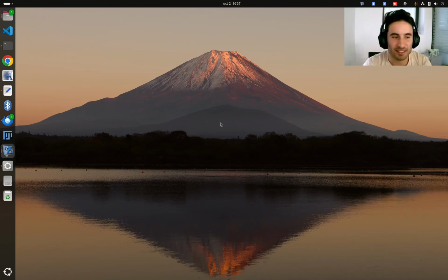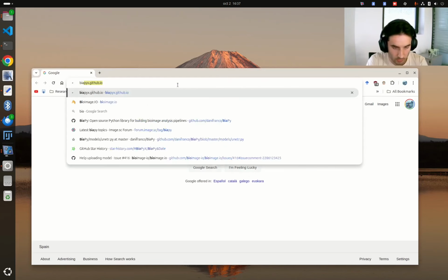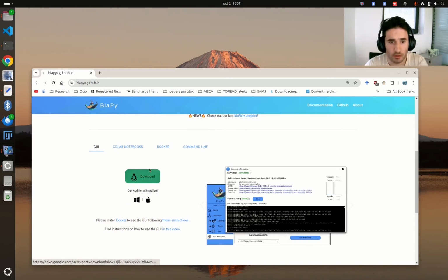Hello everyone. Today in this video I'm going to show you how you can run BiaPy through the graphical user interface. So first we need to download the graphical user interface, okay? If you open a browser, you can go to our landing page, which is biapyx.github.io. Here in this landing page, apart from a few useful links like documentation or GitHub code, you will find also a button to download the binary.